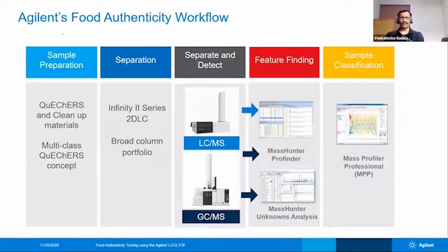One is the sample preparation. Usually you use a QuEChERS method to deal with this food matrix, and you use a QuEChERS cleanup, or sometimes you use the Agilent Captiva cleanup procedure so that all these unwanted lipids are removed and you have a good sample preparation done.